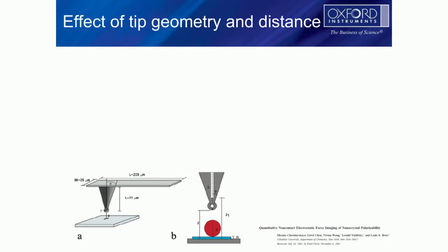That voltage that you're looking at on your instrument is actually a real distance. Typically it can be anywhere from 20 to 75 nanometers per volt. Well, that means, and we measure it on the Asylum instruments by the actual physical amplitude, where it's half of the peak to peak.